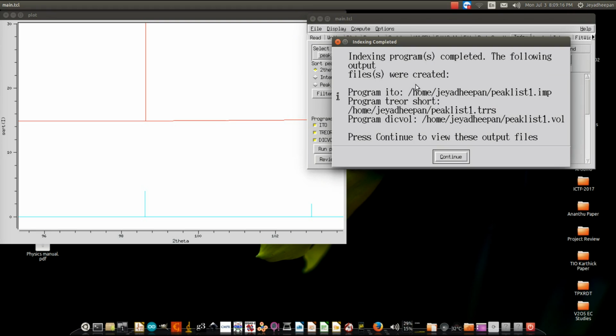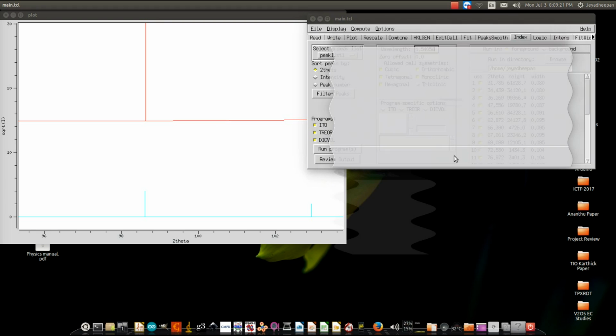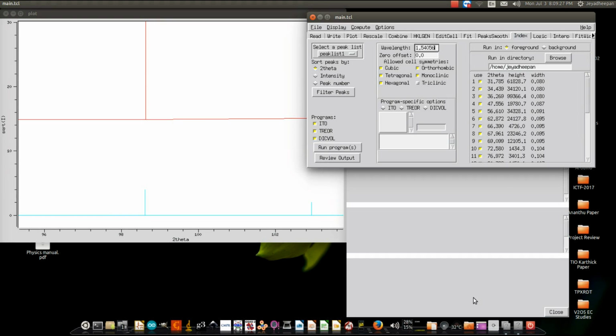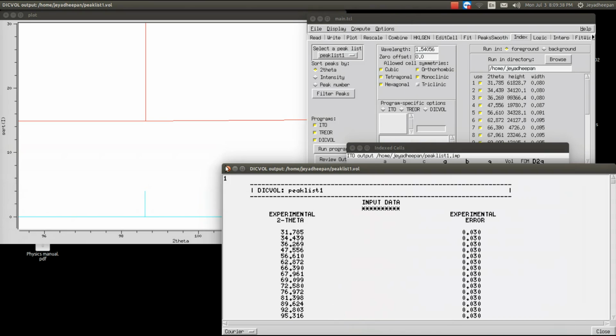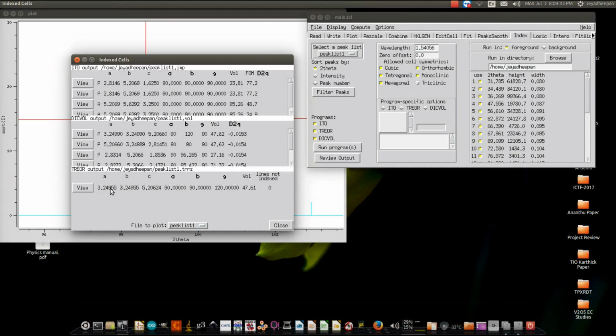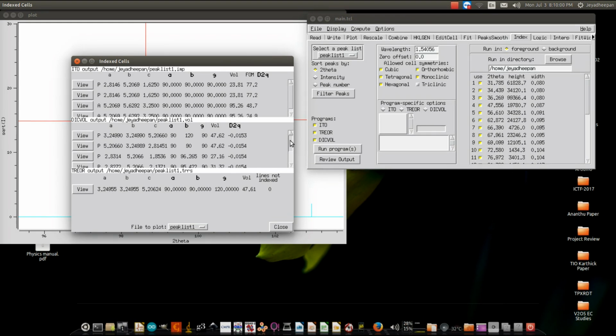The next thing is indexing of my peak. So from here the logic itself you can have what is that crystal structure and all from that reference database alone, but you have the peak list, so you can do that indexing of your own diffraction peak list. So that also you can do it, and the indexed results also can be compared with your JCPDS card.